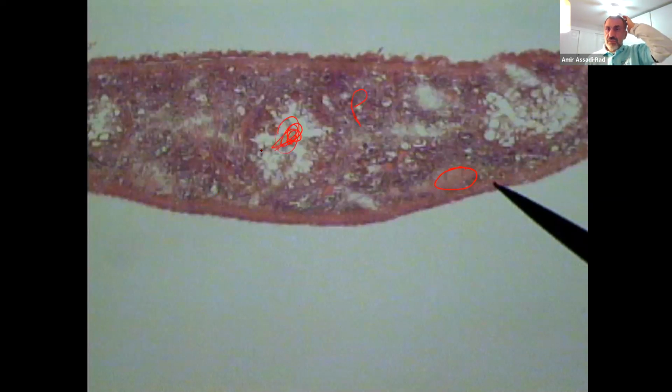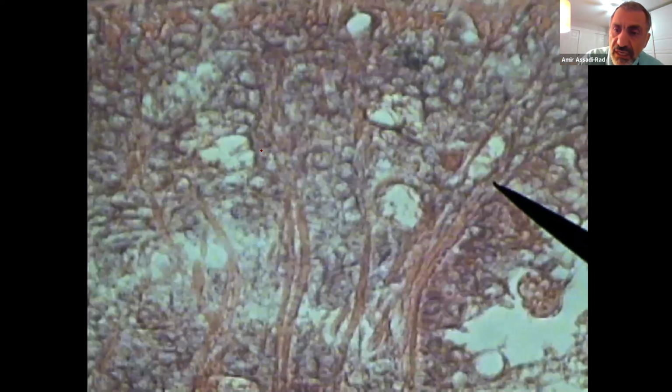Okay, so you already saw circular muscle, longitudinal muscles. These are radial muscles right here. So you can see nice, beautiful radial muscle. Remember, we talked about it in lecture. You have circular, longitudinal, and now radial.